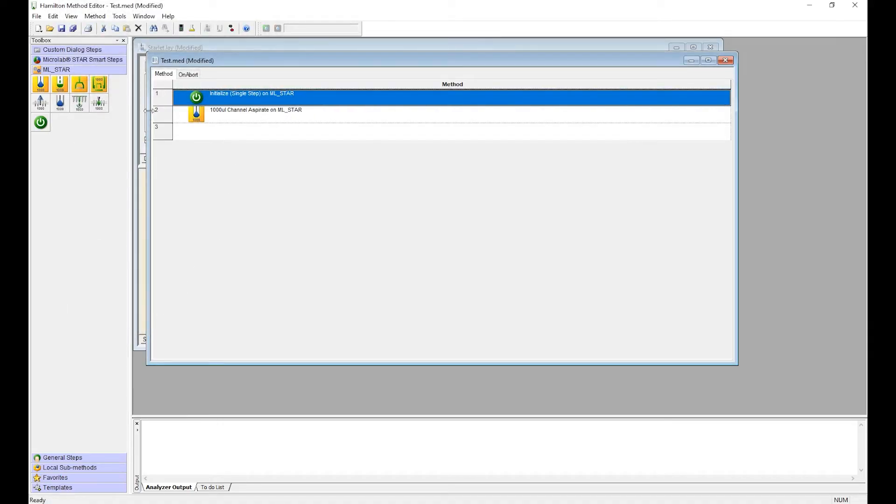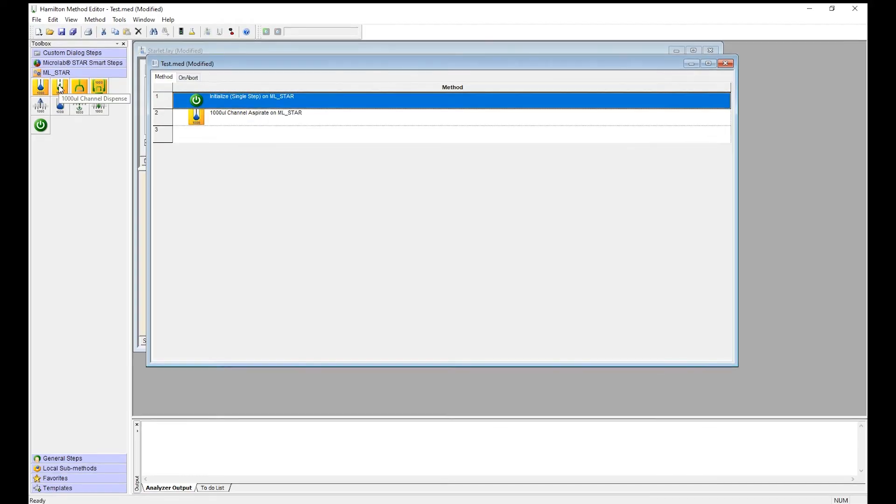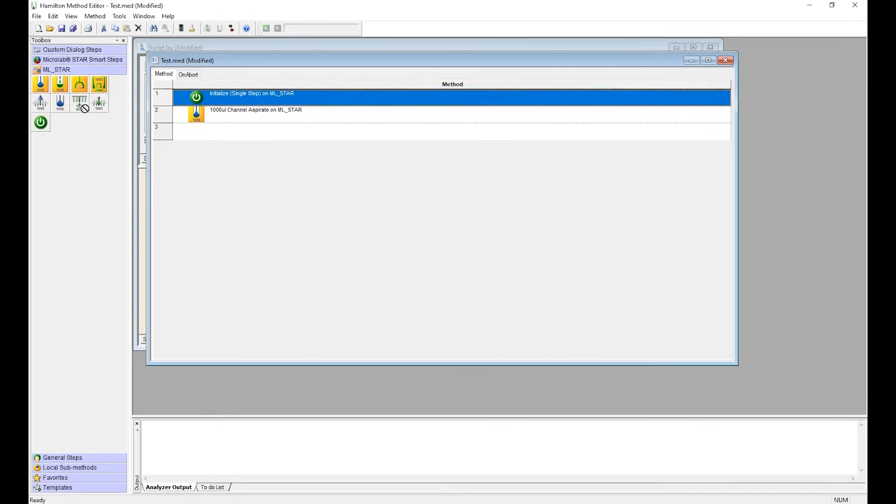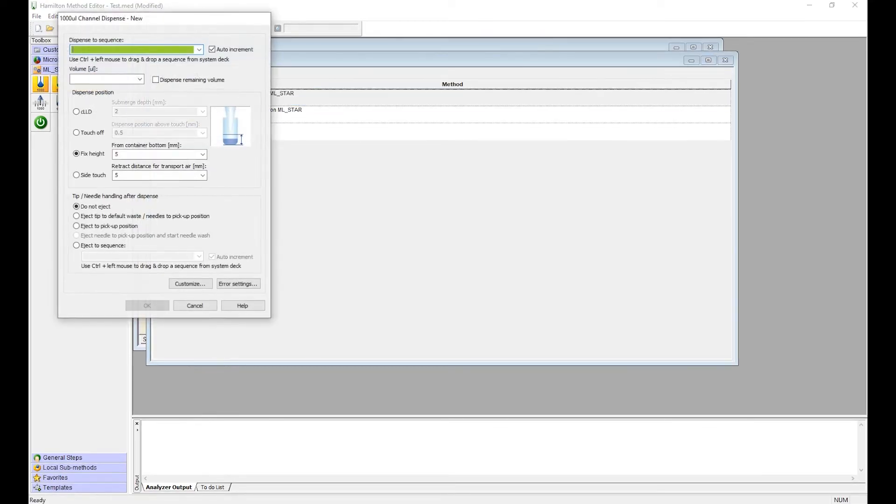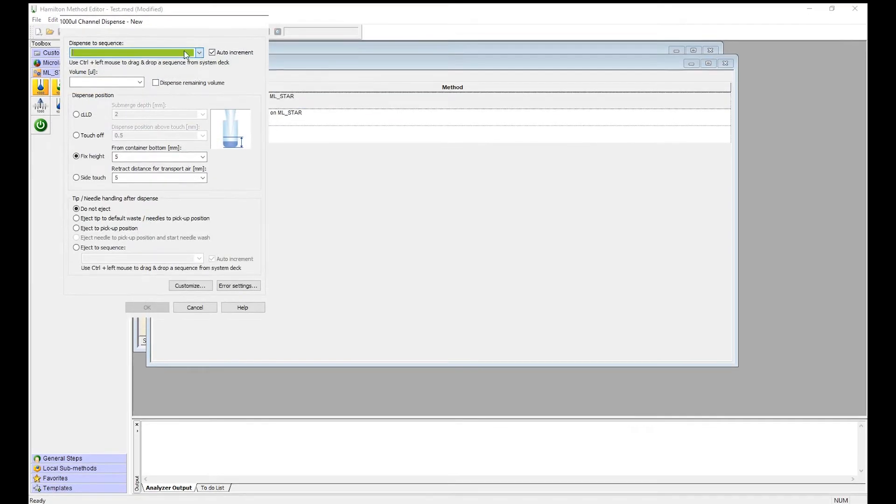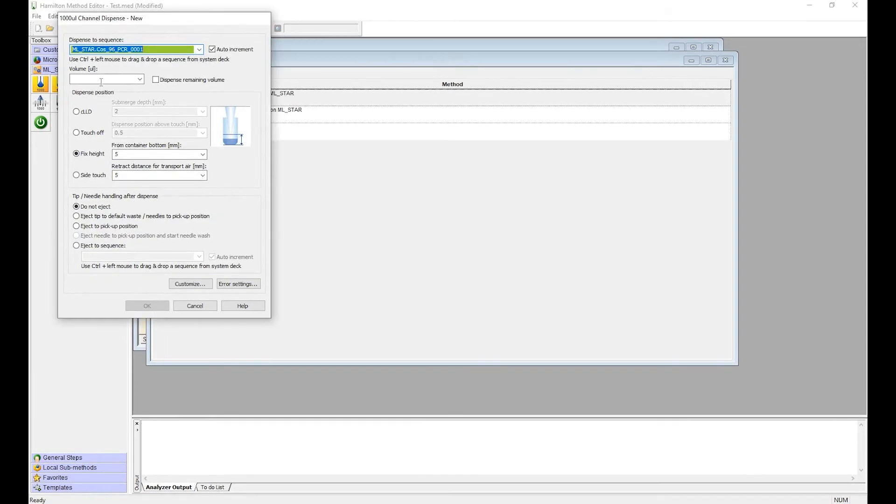Now that we set up our aspirate, we're going to set up our dispense. So click and drag it to the position here. Where do you want to dispense to? Into the PCR plate. If you have a different volume, you can put it in here or you can just dispense all the liquid that's in the tips.